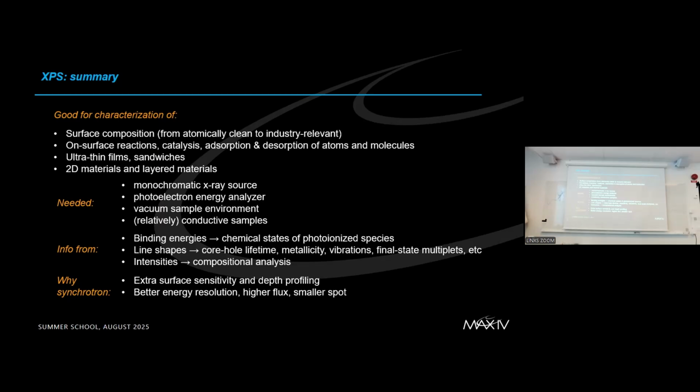First of all, when the photons are hitting the sample, they are getting absorbed at a distance from the surface of maybe several hundred nanometers. So if you would use a photon in, photon out technique, then your information depth would be several hundred nanometers or even microns maybe.